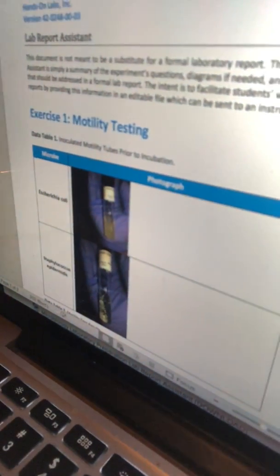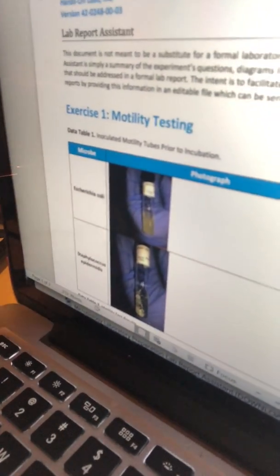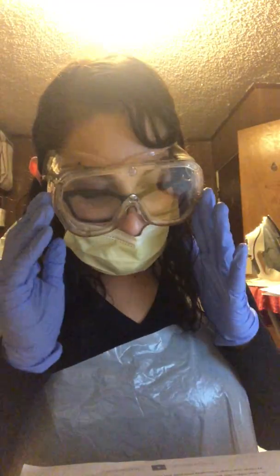Okay. And then I took pictures of it before we started. So I don't know if you can see it on my phone, but of course on my lab assistant you'll be able to see it. It's just clear. It's a little bit cloudy, but there's no thick line around that area where I just showed you the negative lines.